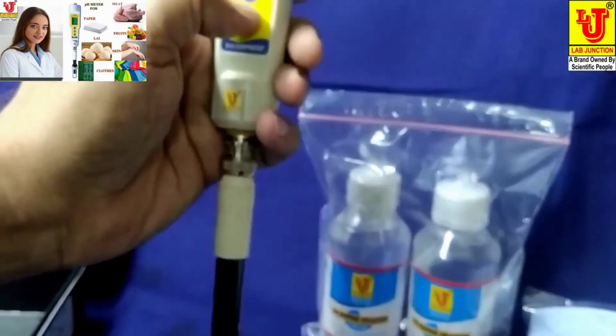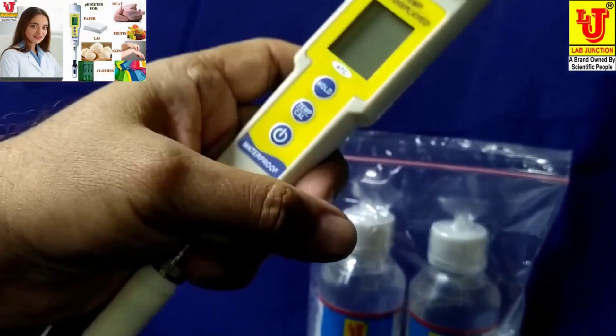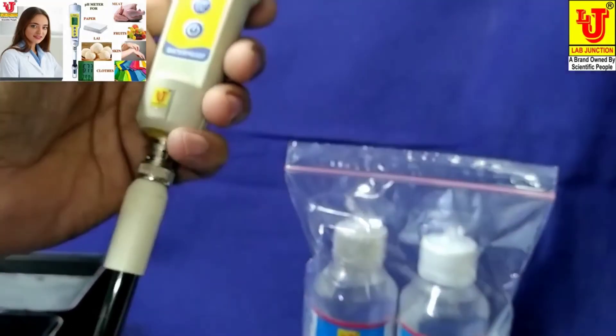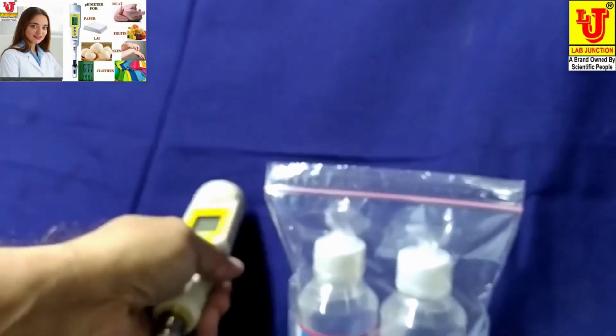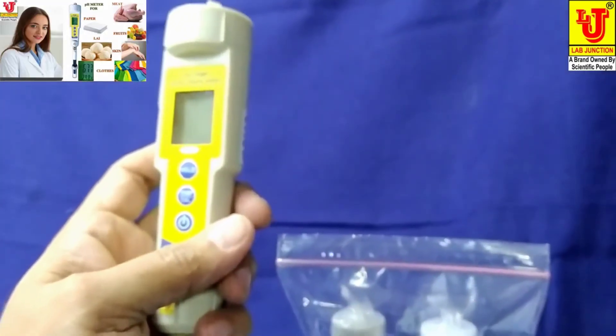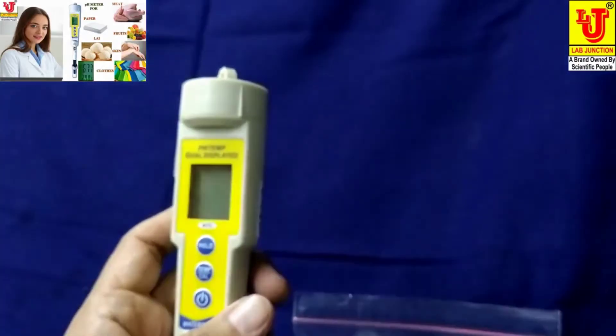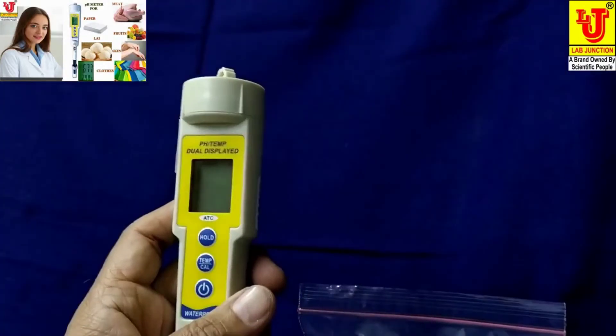Now I am switching off the pH tester. This is the final demonstration and installation of the waterproof pH and temperature dual-display meter. Thanks.